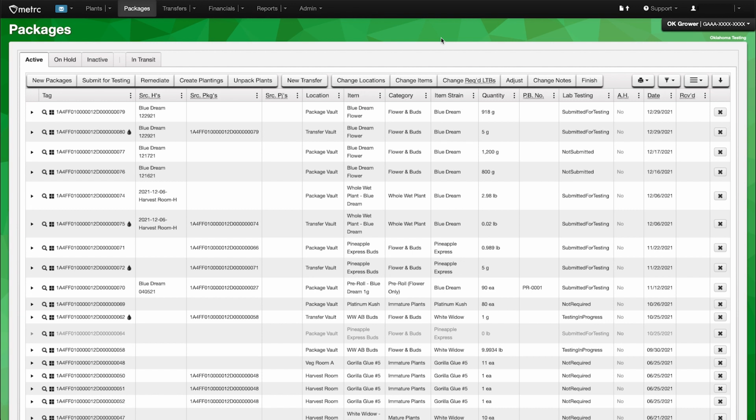Okay, I'm just going to take a quick minute to show you what the steps within Metrc are for submitting a sample for testing from a source package. One caveat I want to bring to your attention: these would be the steps that you would follow if you're working directly in Metrc. If you're using your own inventory management system, these are the steps that you need to be sure your inventory management system follows within this particular order to assure seamless transfer and test requests from your facility to the testing laboratory, and then assuring that the results come back and are associated with the correct package.